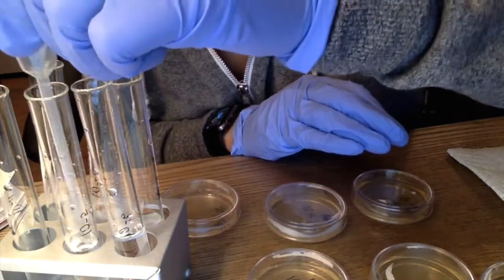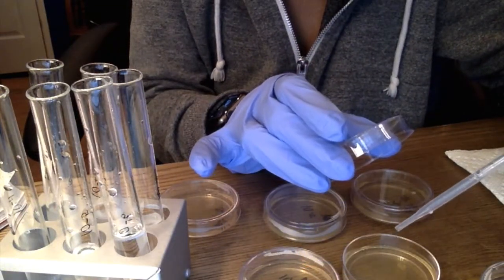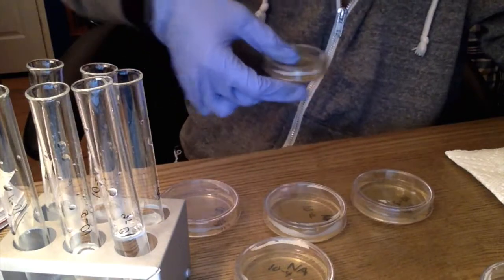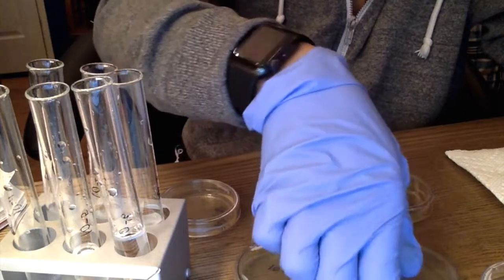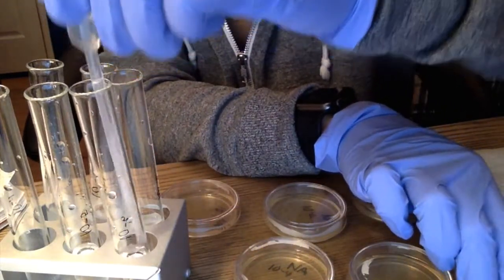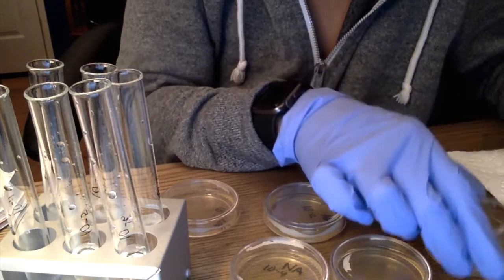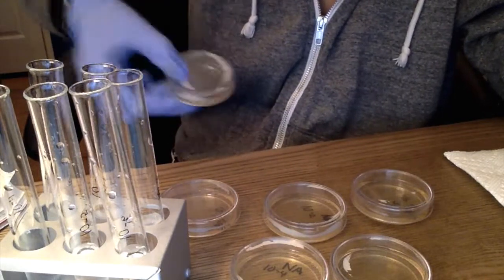There we go, I've got 2 more to go. Here's 10^-5, we've got 1, 2, and 3, 4. Go ahead and swirl that around. Alright, and then for our last one, 10^-6, which has the least amount of the original culture from 10^-1. And again, swirl that around.